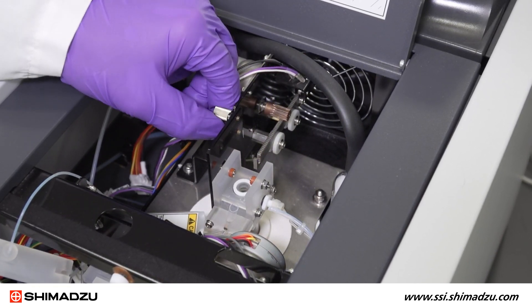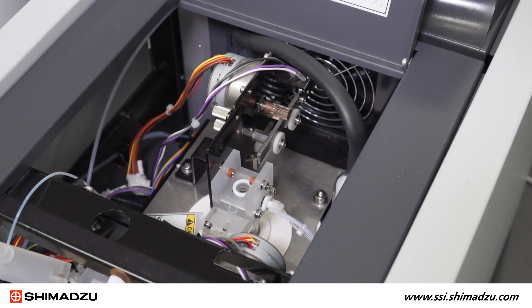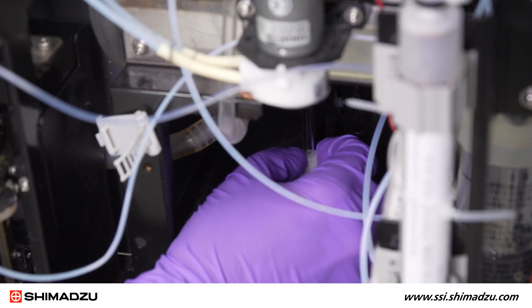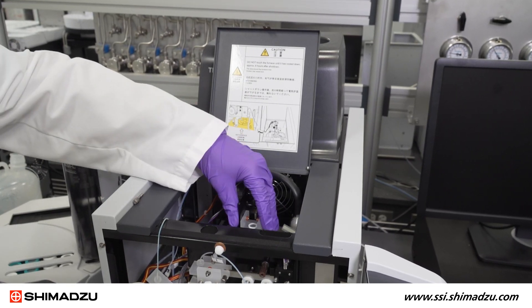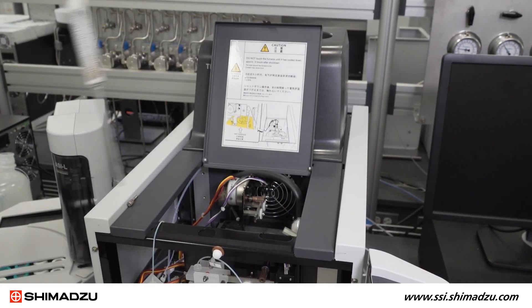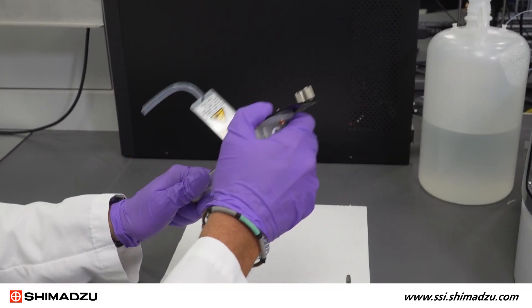Now, loosen the two sample injector retaining screws, once again making sure not to fully remove them. Then, loosen the fitting at the bottom of the combustion tube. Now, the injection block assembly with the combustion tube attached can be lifted up and out of the furnace, and the combustion tube can be detached from the injection block assembly.